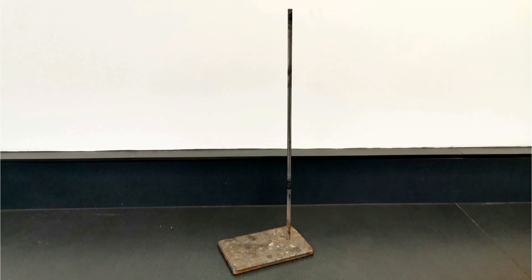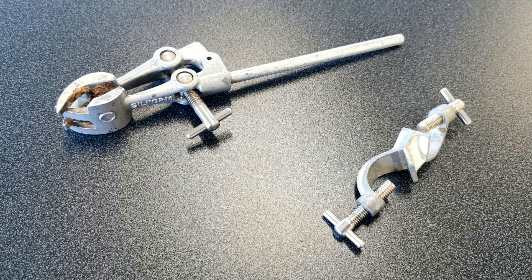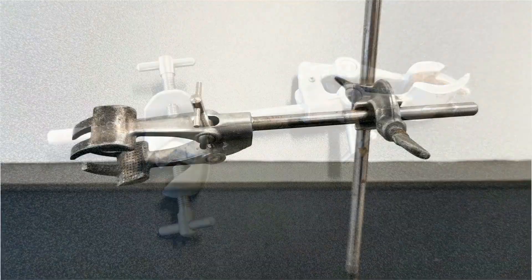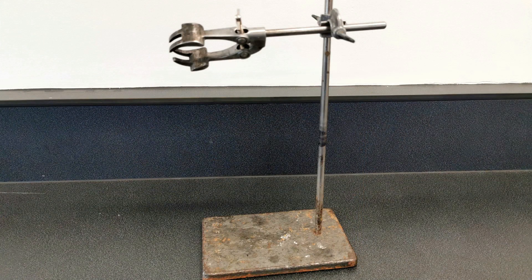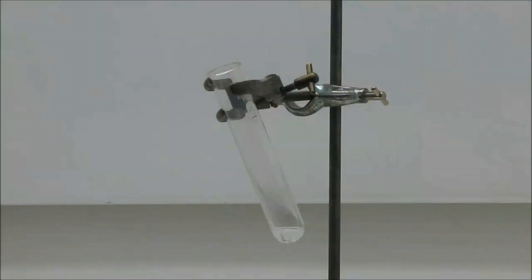Here's another piece you'll see in the science lab — this is a retort stand. It tends to come hand in hand with a boss head and clamp, which attach together and then attach onto the retort stand. From this you can clamp things you don't want to hold for five minutes or two hours — maybe something getting hot. You might even clamp a Bunsen horizontally so the flame comes out sideways, or you could clamp a boiling tube with some heated potassium chlorate and then drop in a jelly baby.